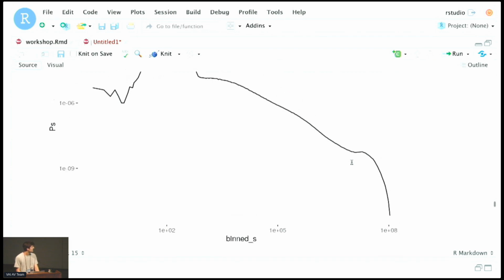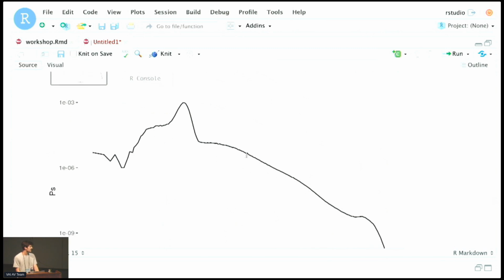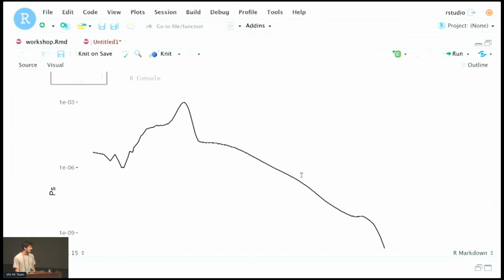Okay, and again, that's more than a diagnostic plot. That's typically some of the endpoint analysis when you perform chromatin conformation capture. The behavior of genomic interactions as a function of the genomic distance is typically something that we'd want to measure, and is typically one of the purposes of performing chromatin conformation capture.